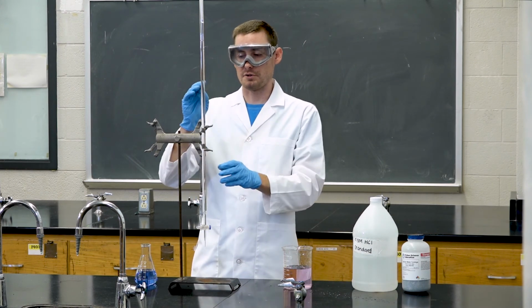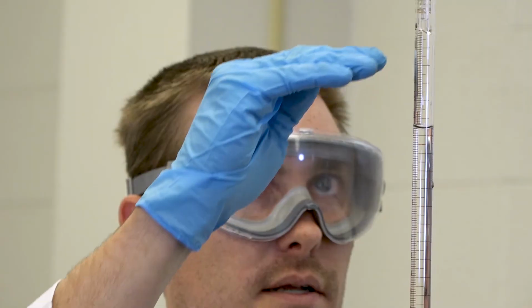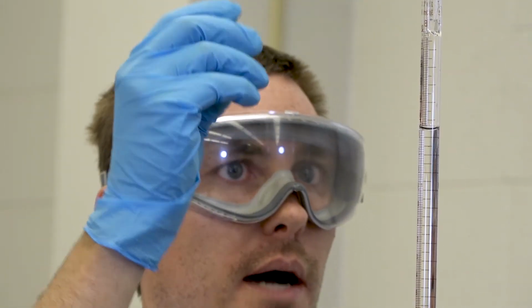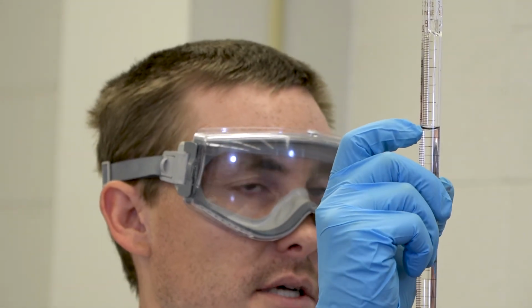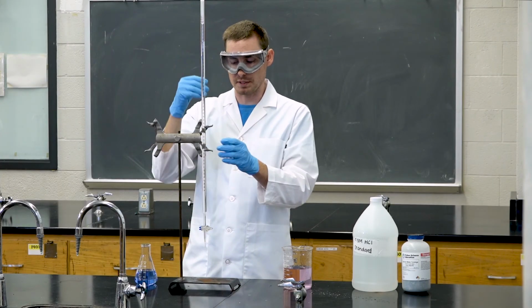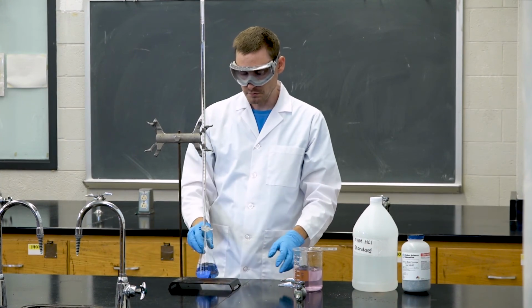It is not vital to fill the burette exactly to the 0 milliliter mark. You can stop short a couple of milliliters and then just determine your starting volume by reading the gradations on the burette. Once you have determined your starting volume, you can then start your titration.